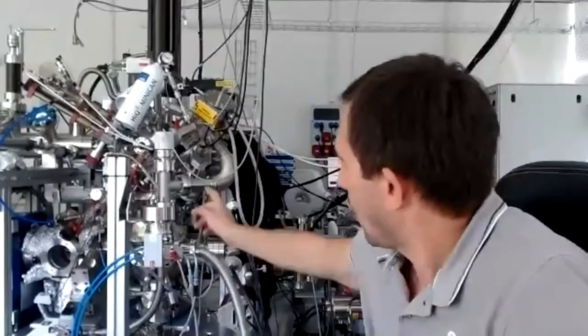So the important thing is that now we have a sample inside. We will use palladium, just a single crystal, which is a known catalyst for CO catalysis and so on. We clean that crystal by sputtering and by annealing. And what we would like to do next is just to transfer this sample to the NAP cell.